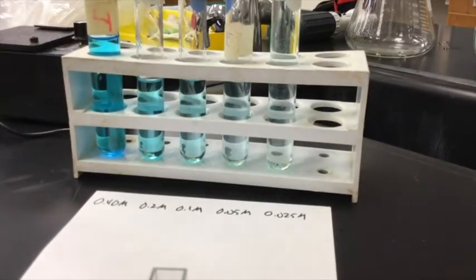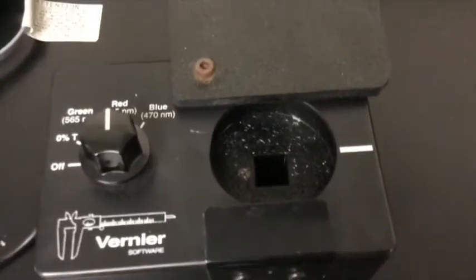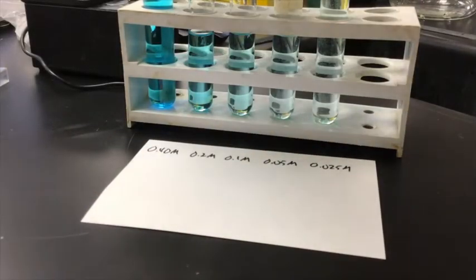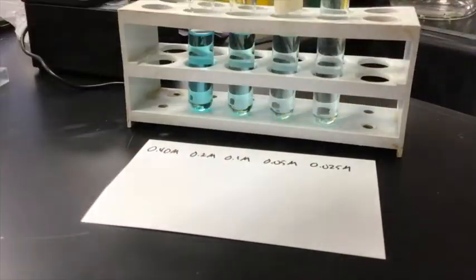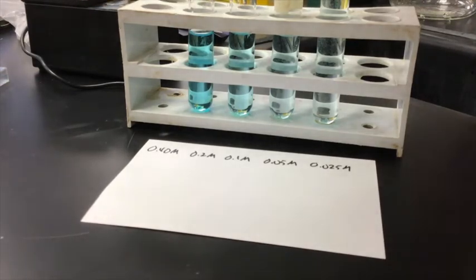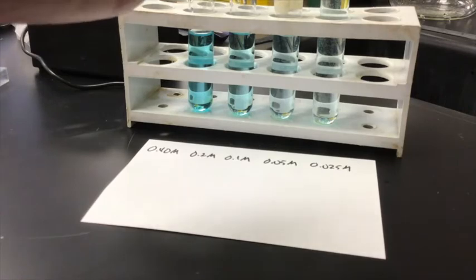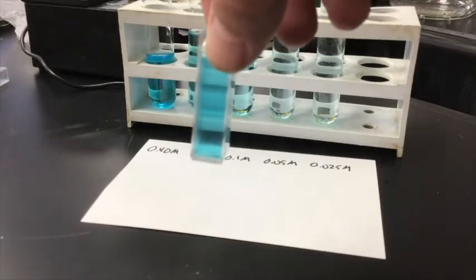Now you take the cuvette out. I have opened it up and taken out the cuvette that just had the water in it. Now I'm going to dump it out, and I'm going to pour the 0.4 in. Rinse it a couple of times: put it in, dump it, put it in, dump it, and then fill it again. Should be more than enough. So that's now the 0.4.